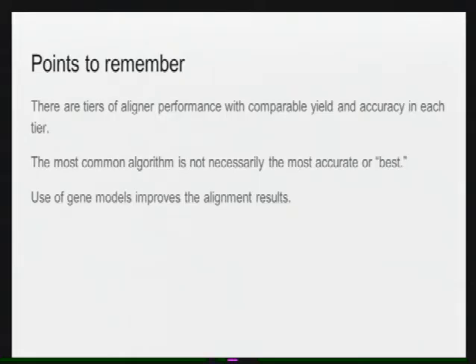Sure. So usually the way I would handle that is I would first quantitate the transcripts. Are you talking about novel transcripts or just alternative isoforms? Right. So for that type of analysis, there are two approaches that I take. One is that I'll quantitate the data at the exon level, and then I will use a method that looks for differential usage of exons, which is one way to get at different use of isoforms.